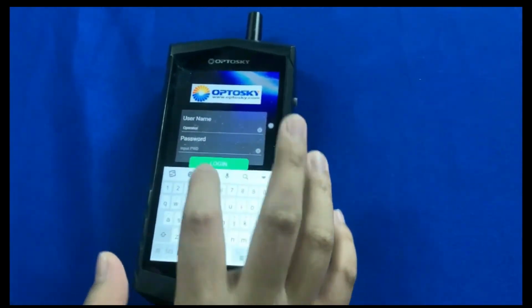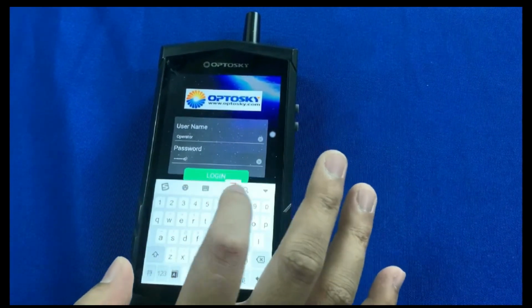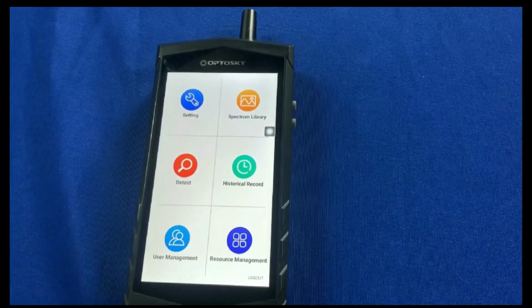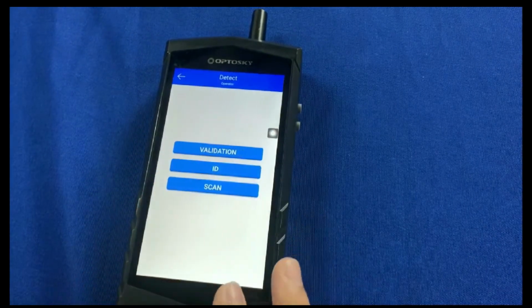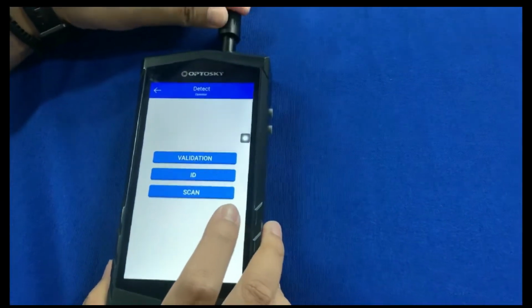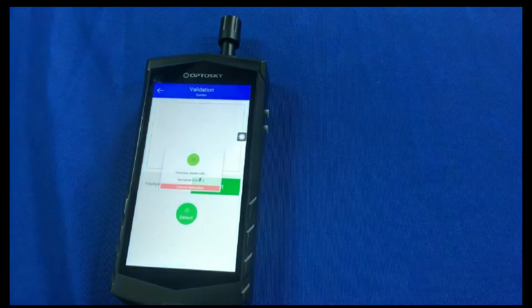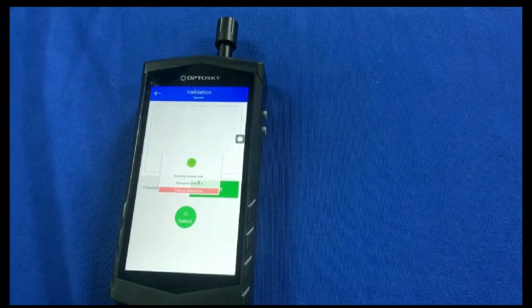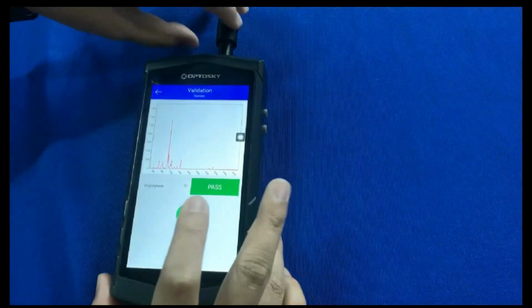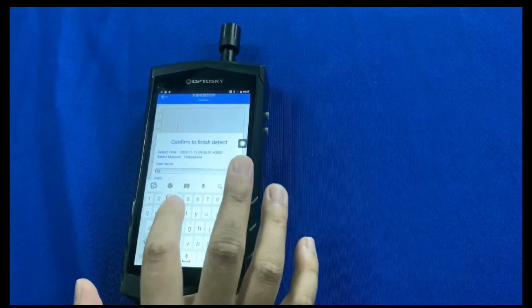First of all, we need to log in to the instrument and perform the validation test. Make sure the validation is linked up, and press the button. And here you can see dictate. You can perform the self-validation test, and the test can pass. Then to complete, you need to execute e-signatures to complete test case 6.